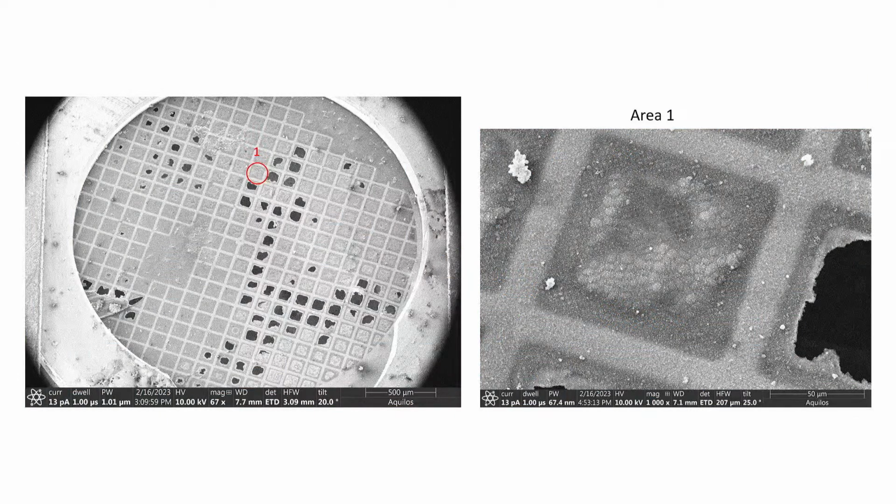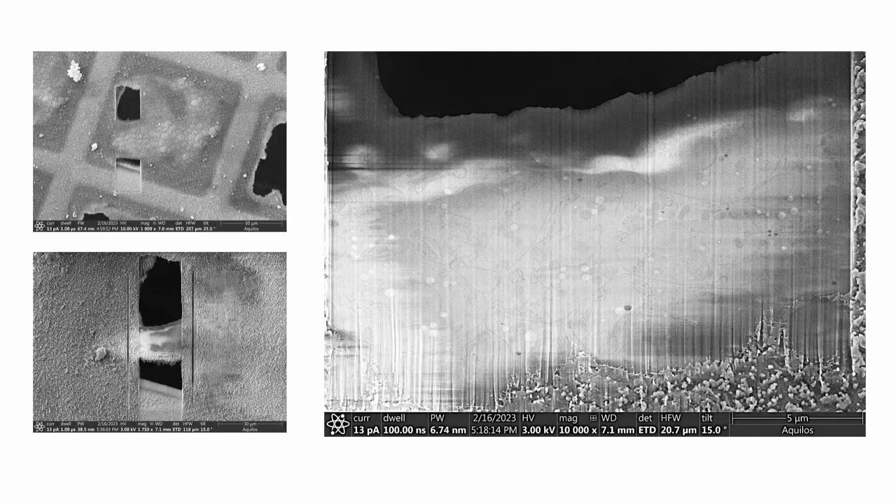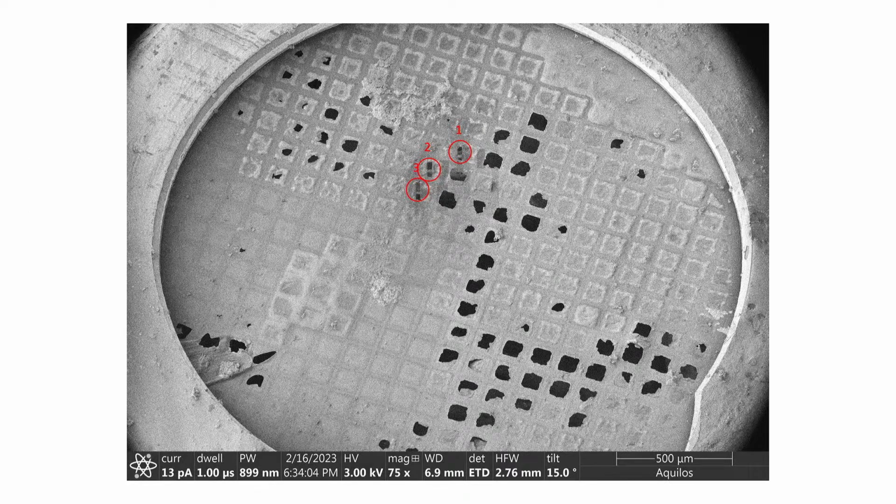So this is the plunge-frozen grid under the cryo-FIB. We can see the cells here, small bubbles. Can you see? They are all packed together in the center of the square of the grid. Then we selected some regions to make the lamella, and we milled the lamella in these regions. You can see here the face of this lamella. There are some cells here, and we saw that we have material there. In this first attempt, we made 3 lamellae, and that was really good.